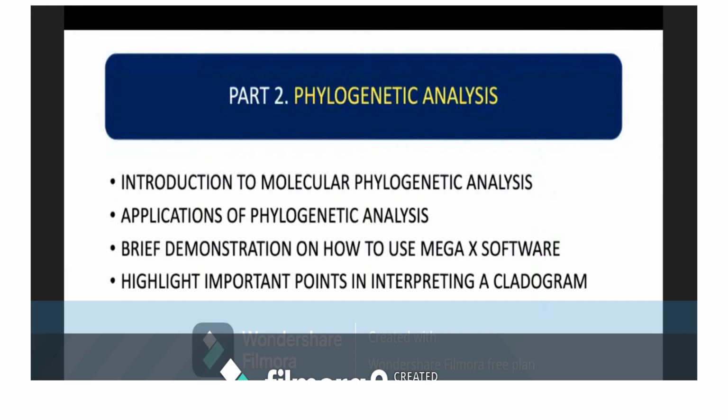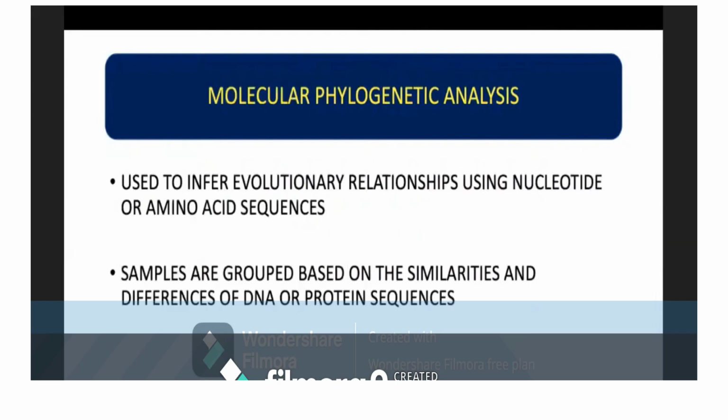Today we are going to discuss the phylogenetic tree and how we analyze it, phylogenetic analysis, applications, and a brief demonstration on how to use the MEGA X software, with important points in interpreting a cladogram. So today we will discuss, side by side, the brief introduction, the applications, and the demonstrations. So keep watching the whole video so you will get the maximum benefit of the demonstration.